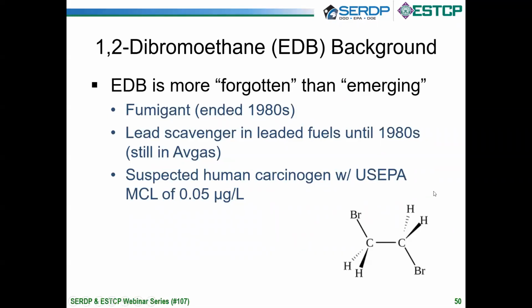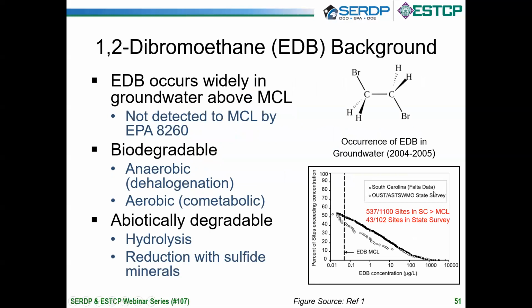So is it out there in the environment? Well, it probably isn't, right? Nope, it is. It occurs widely in groundwater above the MCL. And the problem is that by typical 8260, where you're looking at fuel hydrocarbons or other things at a site, you're not going to achieve this 50 ppt MCL, so you have to use another method to do that.